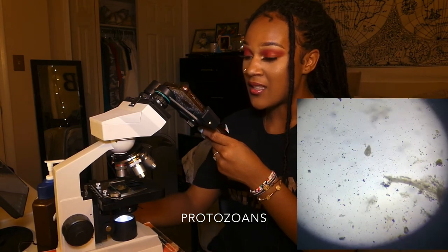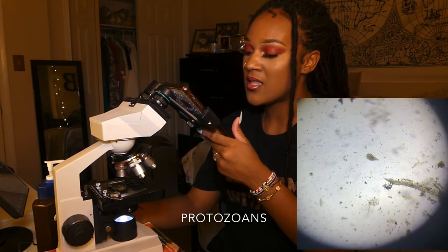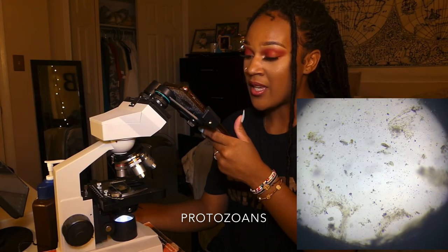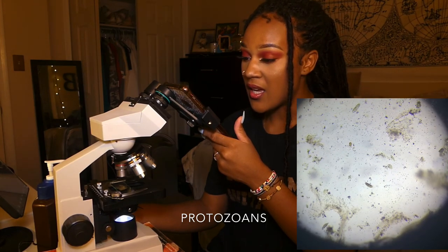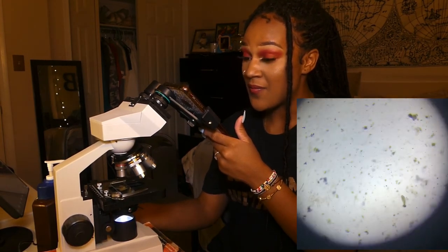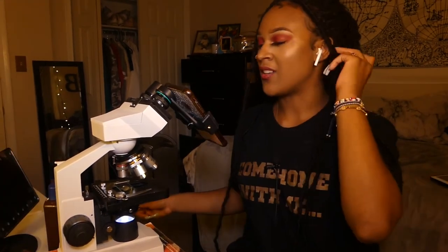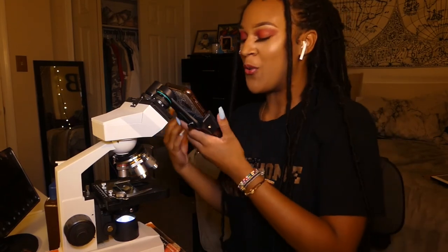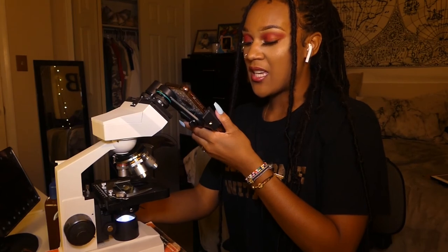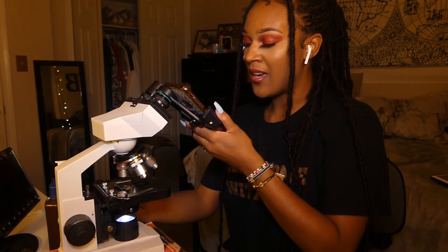What is that? So I put a piece of algae because that's where a lot of microbes eat. And there's so many things right here. I don't know if these are paramecia. They kind of look like it. But. Y'all, I am overwhelmed with how much life is in this. Like, what is that?